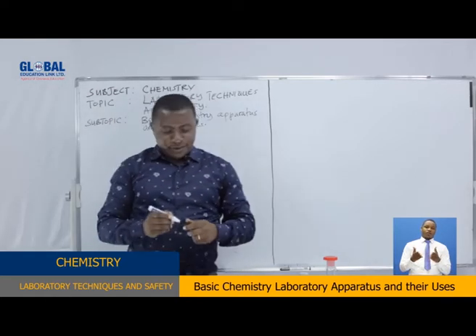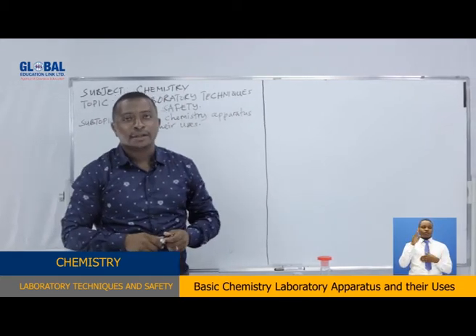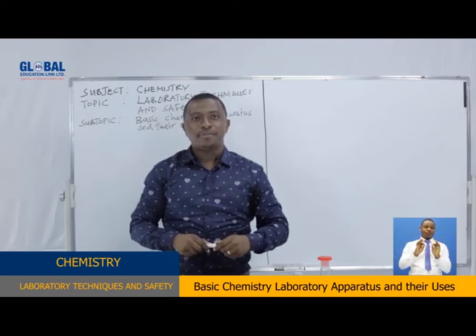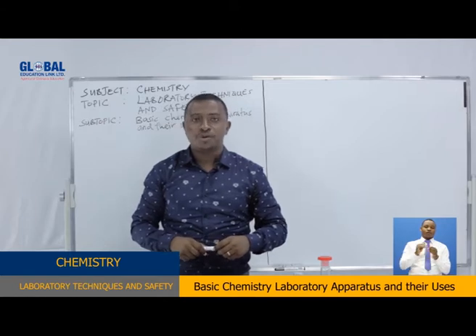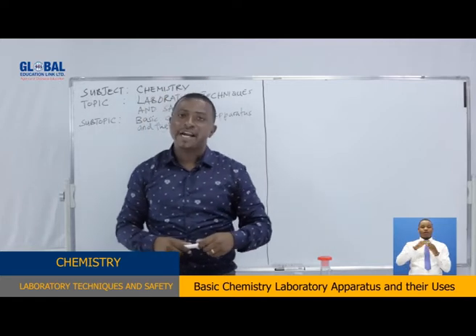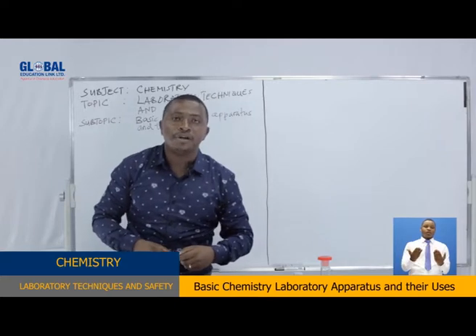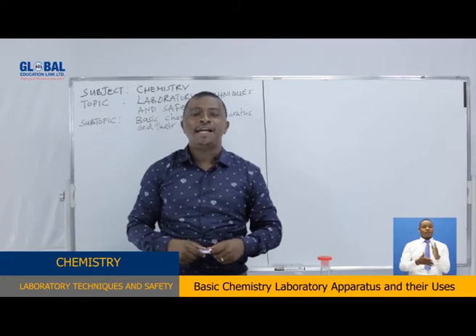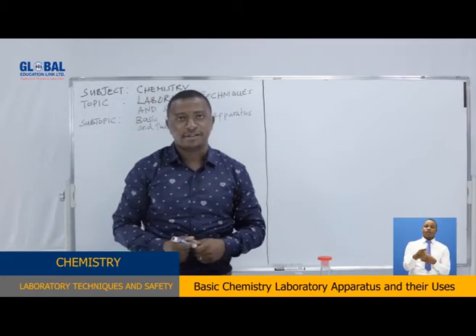Class, you are most welcome to listen and learn about this interesting topic. It's very much interesting because it's the topic that involves the use of the apparatuses. So we shall have to list the apparatuses used in the laboratory. We shall have to classify them according to their uses, and we shall have to learn how they are used in the laboratory. Now let us start the lesson by asking ourselves, what is an apparatus?